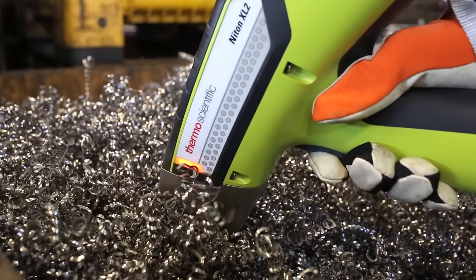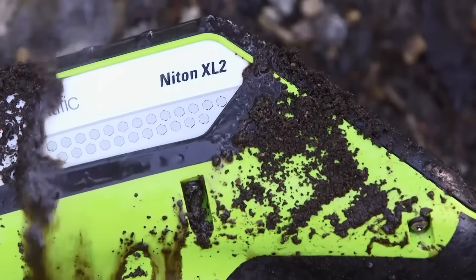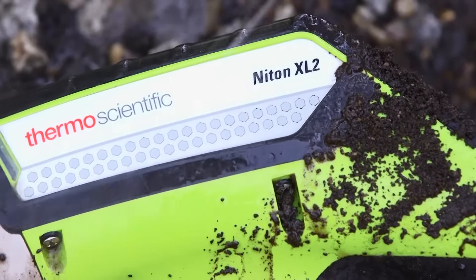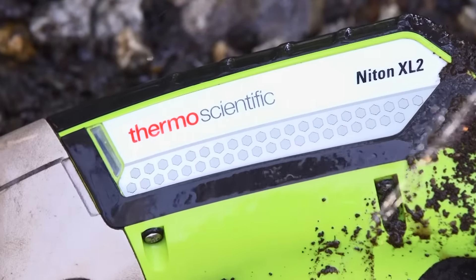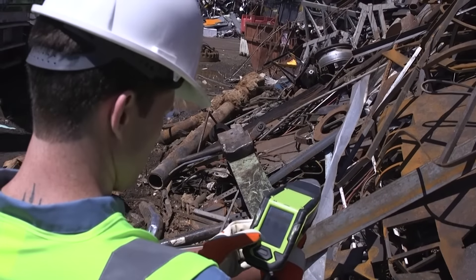Our Detector ProGuard helps you defend against punctures from sharp items. And with a certified IP54 rating, the Niton XL2 Plus is splash and dustproof, ensuring uninterrupted operation even in the harshest of environments.